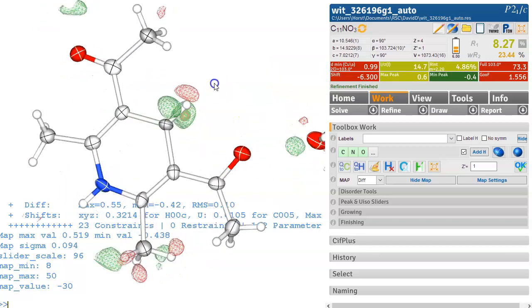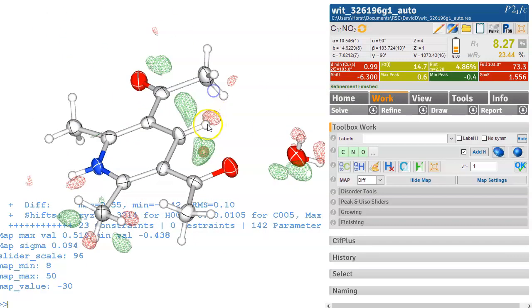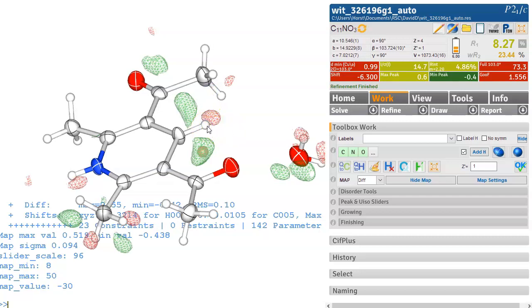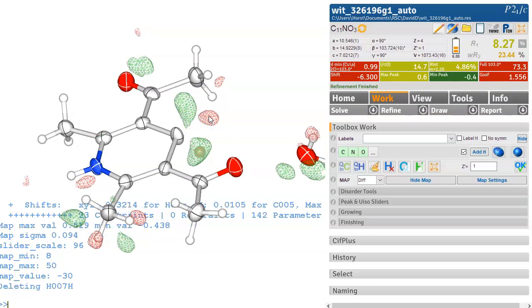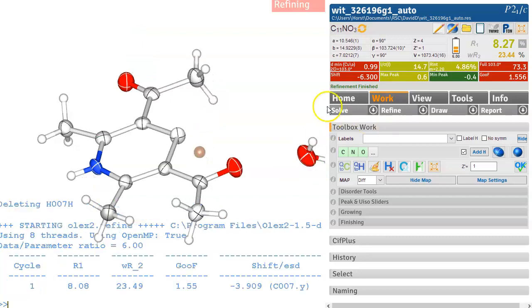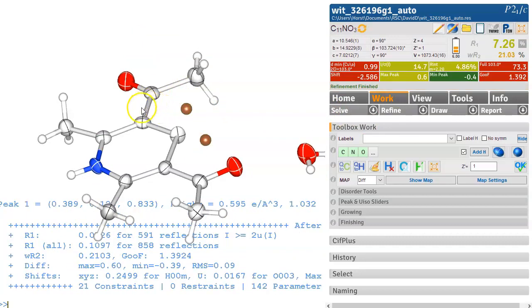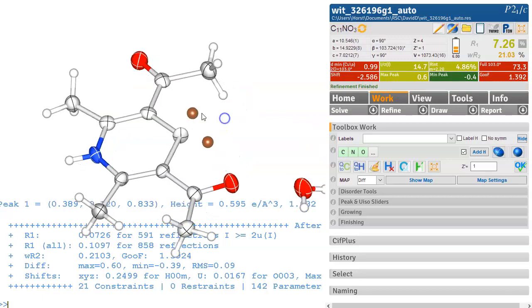So this one here really needs to be different so we can do this in a different way we can first of all delete this one here. One thing you can do of course you can just refine again and then these peaks should come back and these are really prominent now so these two peaks are standing out.